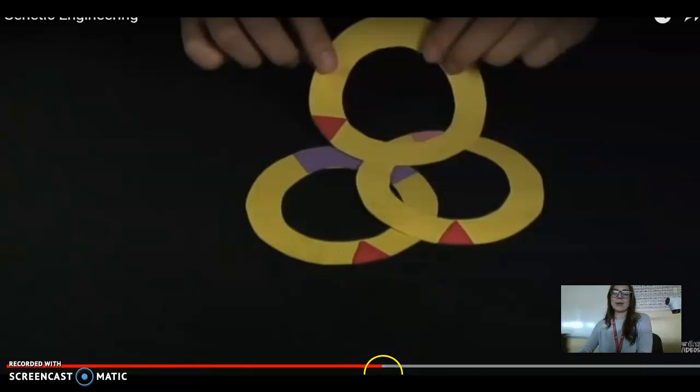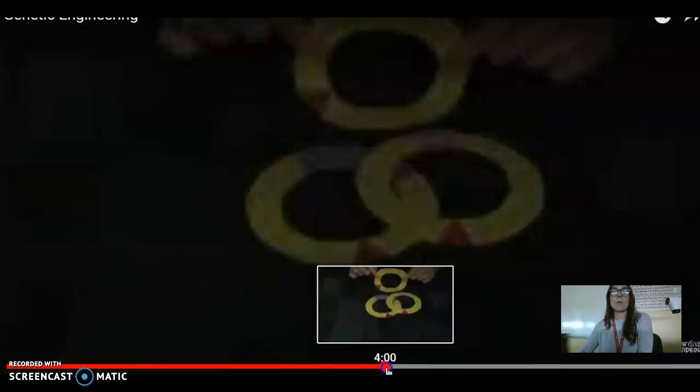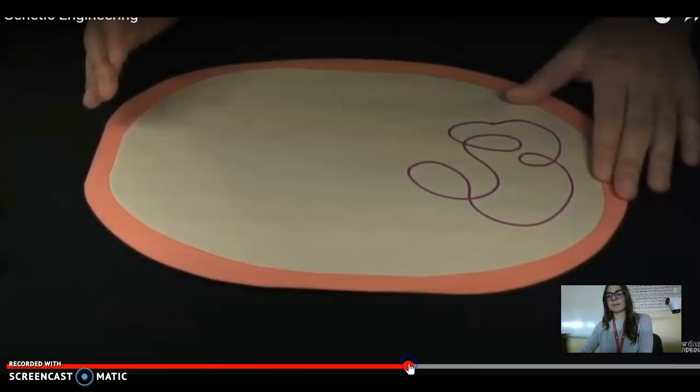So that's what I have here. Very cool, very nice. So how do I get it into the bacteria? Well, I have a bacterial cell. It looks like this. It's unicellular and its DNA is just floating around. So it has its own plasmid. I don't actually edit the DNA of this bacteria. I just stick in another plasmid. And you'll get a nice visual of this in a second.